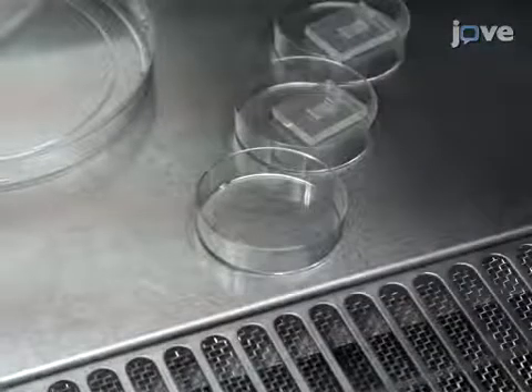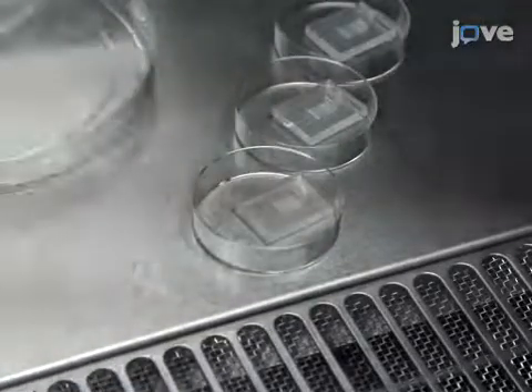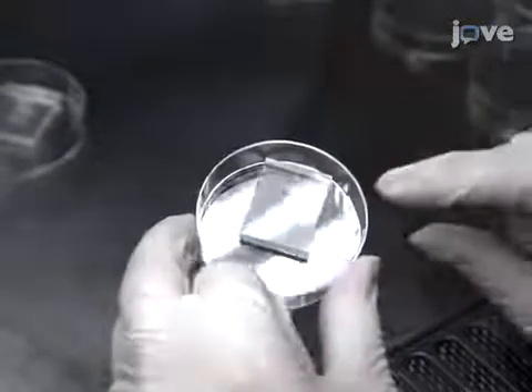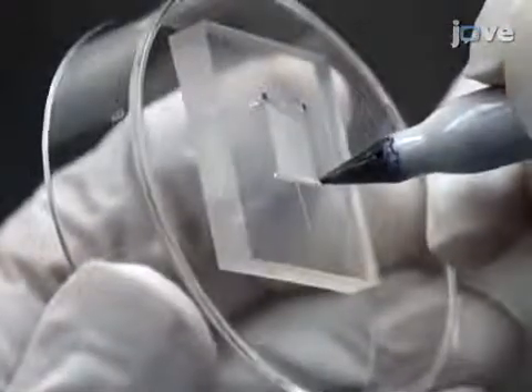Carefully place each matrix into a separate 6 cm plastic dish, striped side down. With one finger, press each matrix firmly. Avoid trapping air bubbles between the matrix and the dish. If the matrix fails to attach, repeat the process. Once attached, mark the location of the stripes on the bottom side of the culture dish.